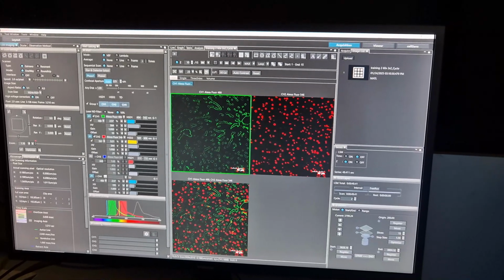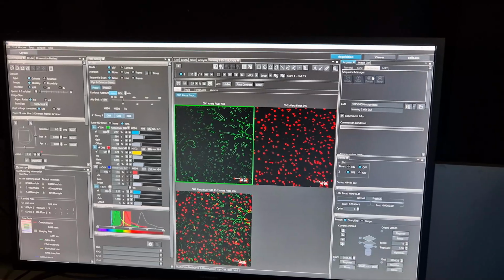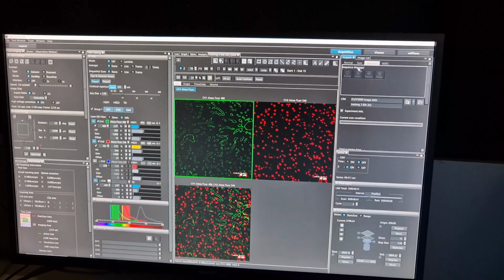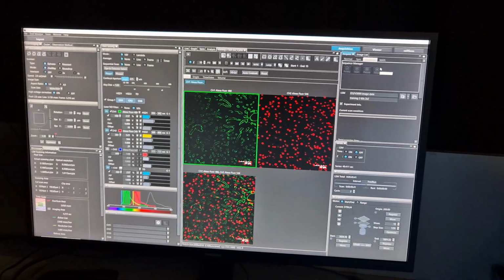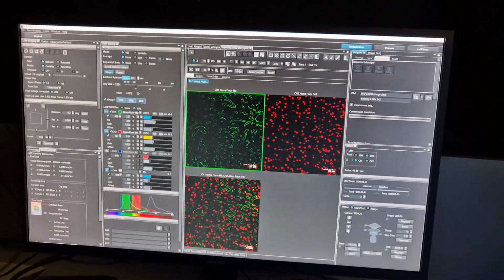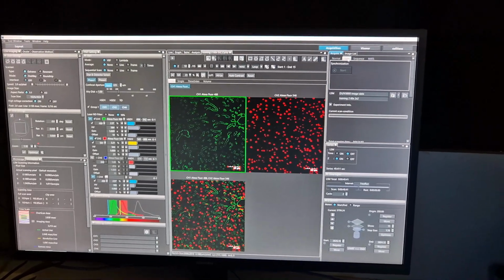There's another set of things which I can show you, but I'm not going to bother because it's going to take too long, and no one's going to use it. I think these are the synchronization and sequence tools, which, like I said, are for if you're doing stimulation type experiments, but I don't think you're doing that. It's going to take too long to go through, and it is detailed in this manual.